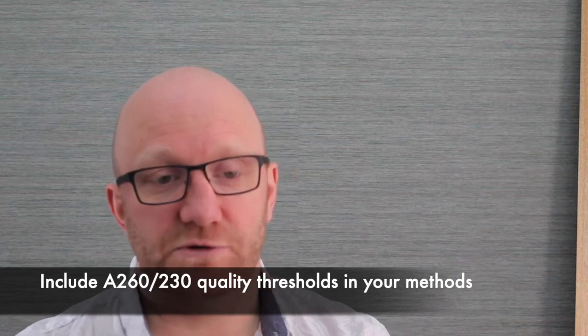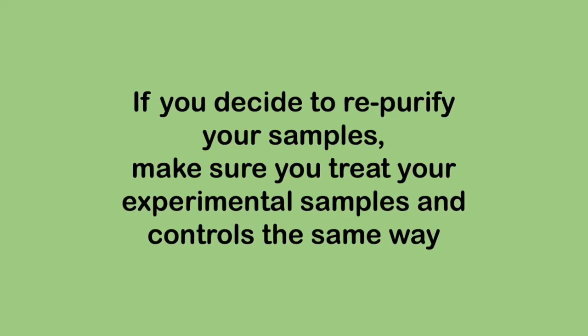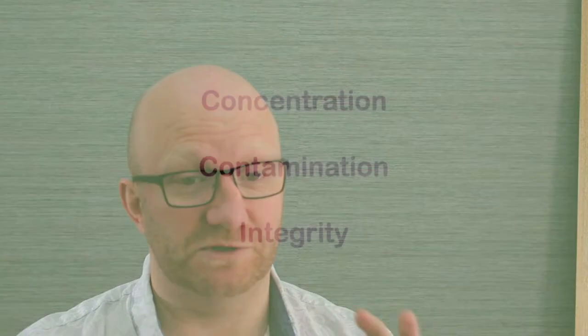Note that an impure sample doesn't necessarily mean that you should be throwing it out. If your concentration is high enough, you might have the option of doing another round of purification to try and remove those impurities. What you should remember is that every time you go through the purification and precipitation process, you probably will end up losing some of your sample, so your concentration is going to go down. So the best thing to do is be very careful the first time and try to get a pure, good quality sample the first time by following the protocol precisely.